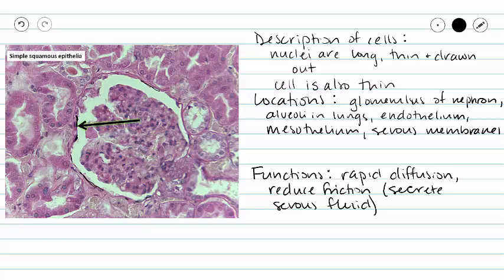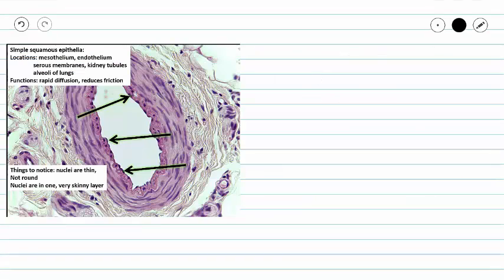Let's take a look at another place in our body where we see simple squamous epithelium. Here we have a blood vessel, and on the very inside of our blood vessel we see endothelium, which is our simple squamous epithelium. I'm pointing to a couple of nuclei here that are pretty thin and drawn out, and surrounding the entire inside of our blood vessel we see that simple squamous epithelium.